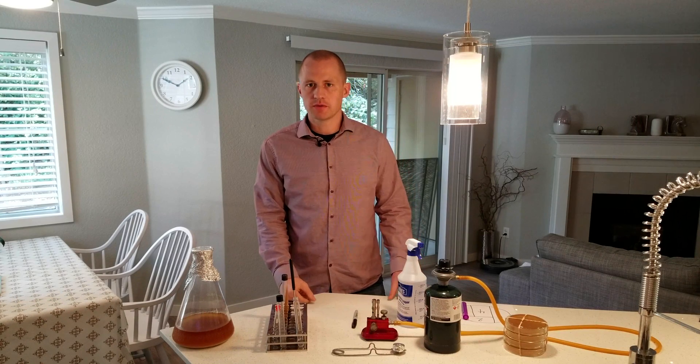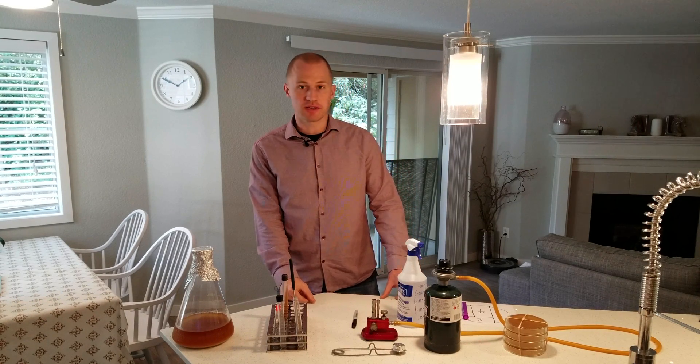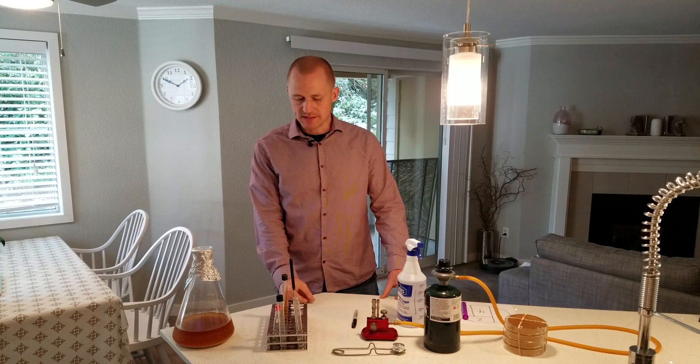Hello and welcome brewers and lab nerds. Today I'm going to show you how to streak an agar plate with yeast.